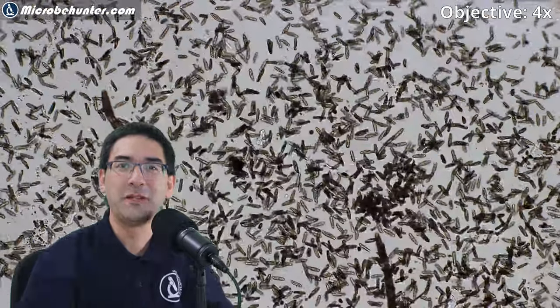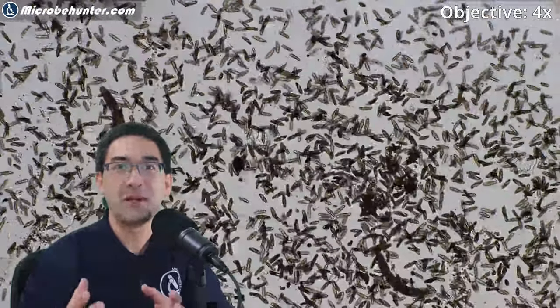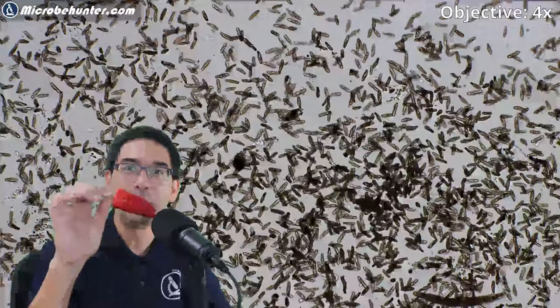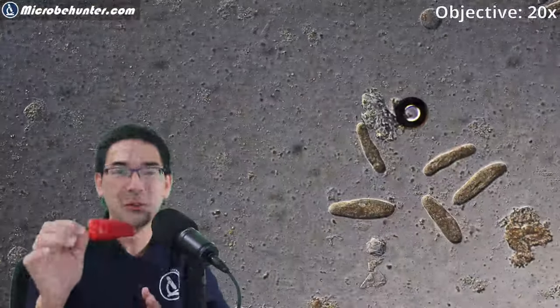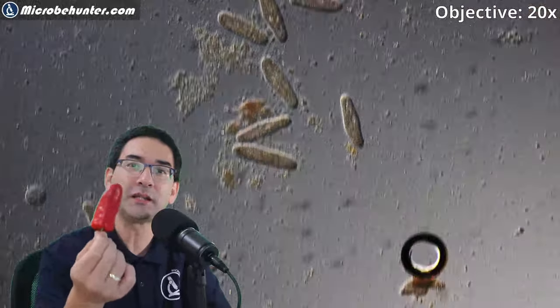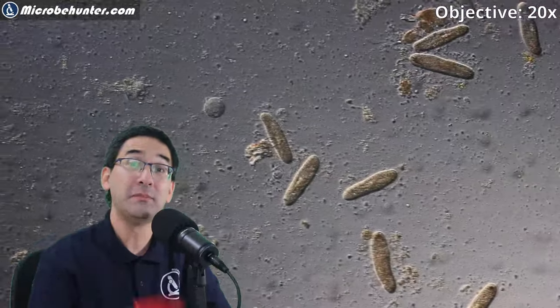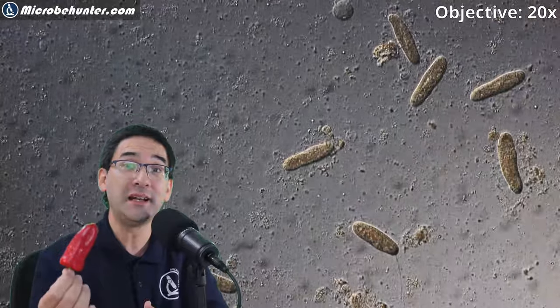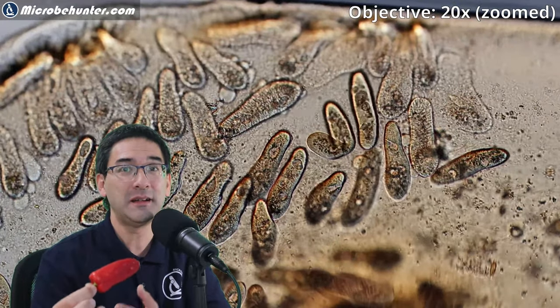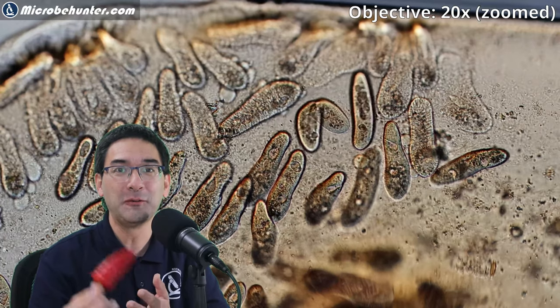Hi, hello and welcome — Microbe Hunter here. These are thousands of paramecia, single-celled protists, and today I'm going to feed them a red hot chili pepper — well, a yellow one. It doesn't matter because the substance that makes it hot is called capsaicin, and many of these paramecia die when they get too high a concentration of this substance.